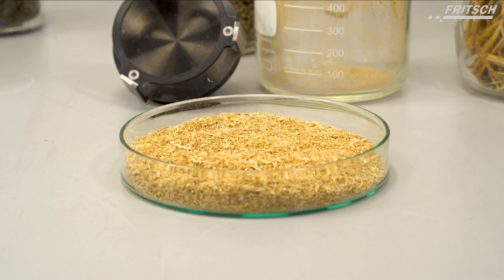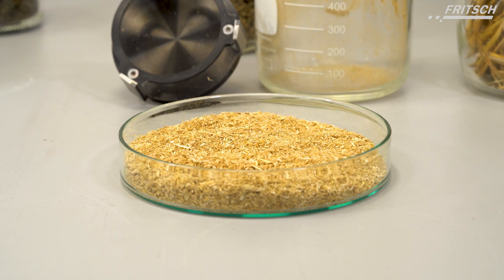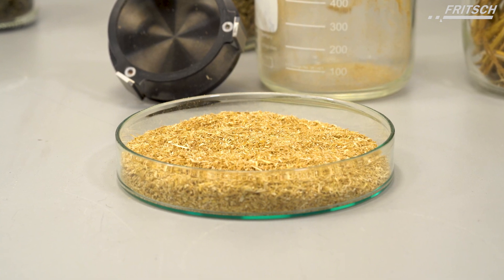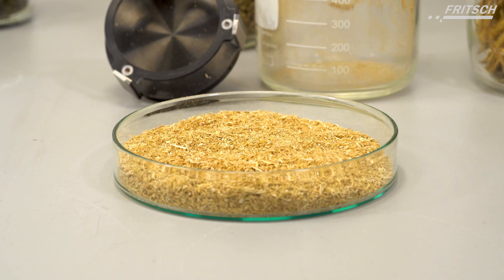With the cutting rotor, you get a fibrous homogenous result. Due to the gentle cutting of the sample, there is approximately 10–20% less heat development on the rotor and hardly any loss of components, such as pesticides or biocides. Perfect for further analysis.